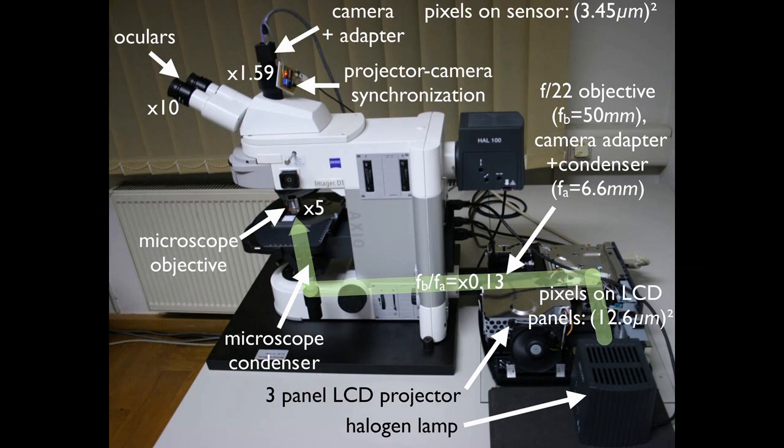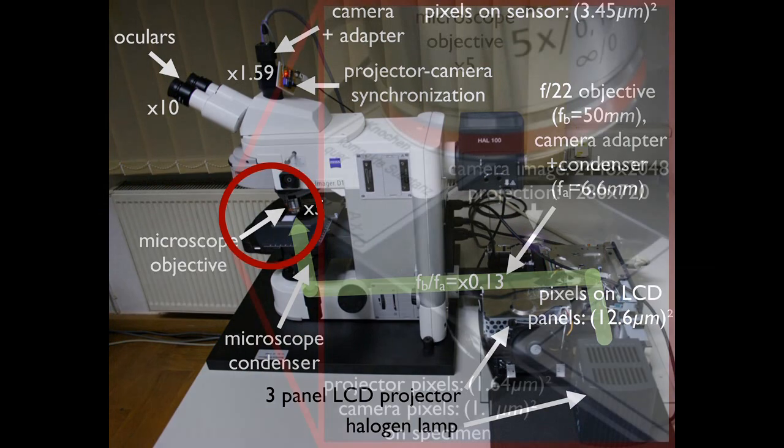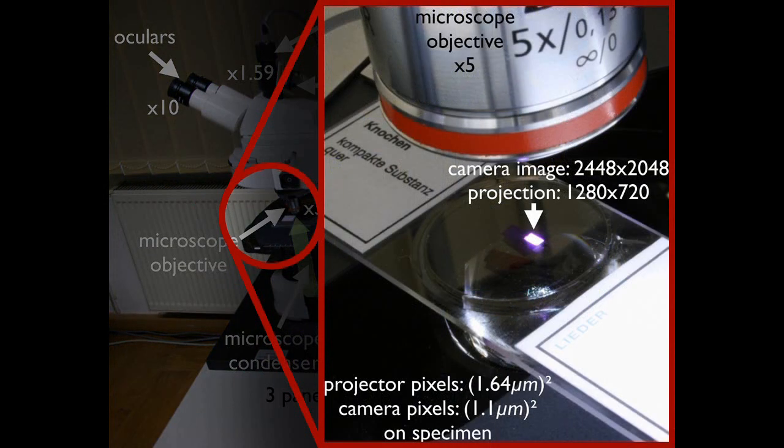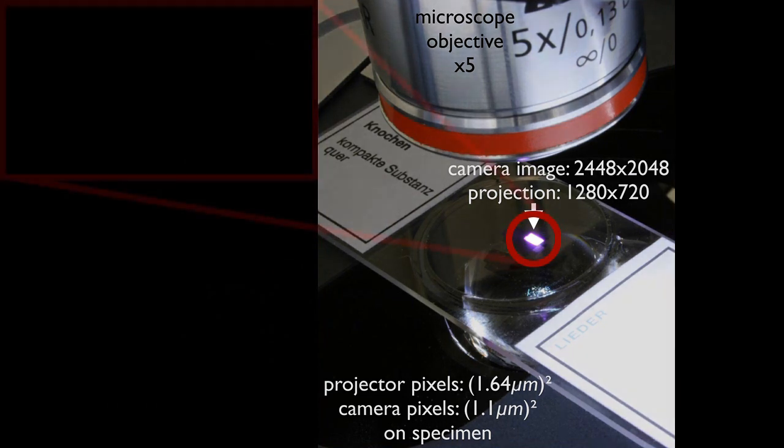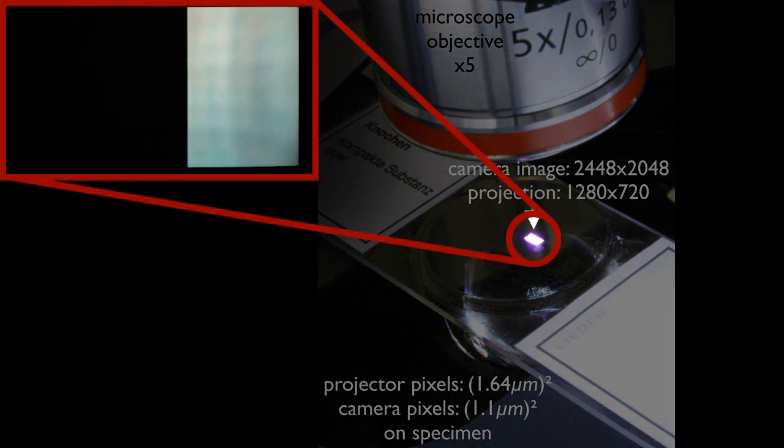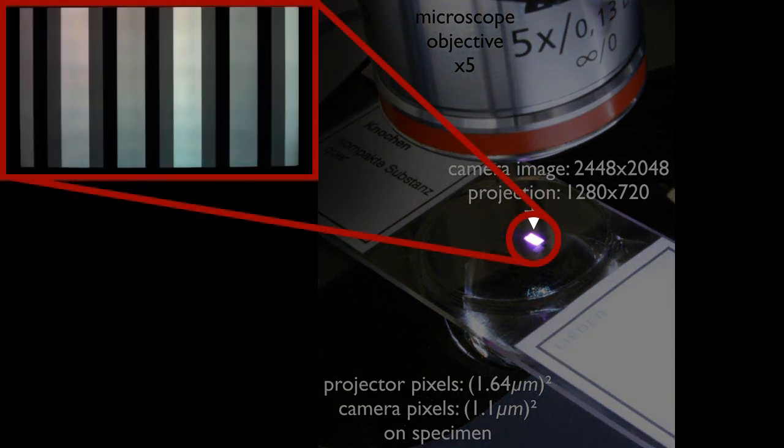For transmitted illumination, the projector is attached to the back illumination port of the microscope. Its image has to be focused separately through the condenser optics. The parameters for geometric projector camera registration and for flat field correction are measured using structured light.